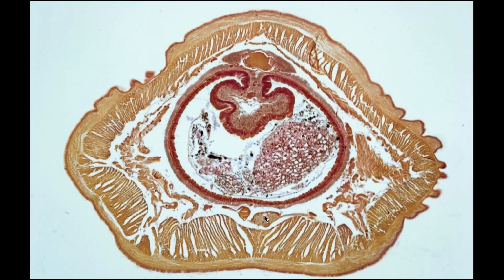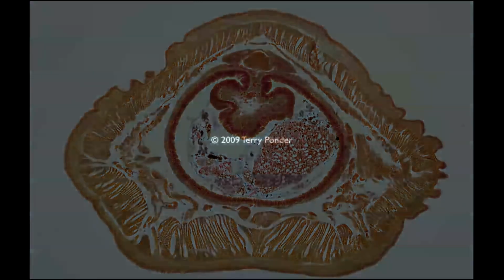It's always a good idea to look at 2 or more slides when studying, since you don't know which one will be used on the lab practical. So, there you have it. A brief survey of the models, specimens, and slides of the earthworm available to you in the laboratory, and the structures and functions that you should learn for the lab practical.